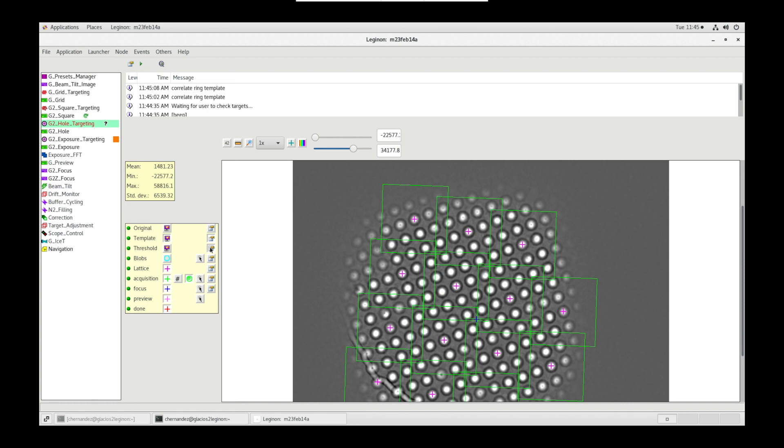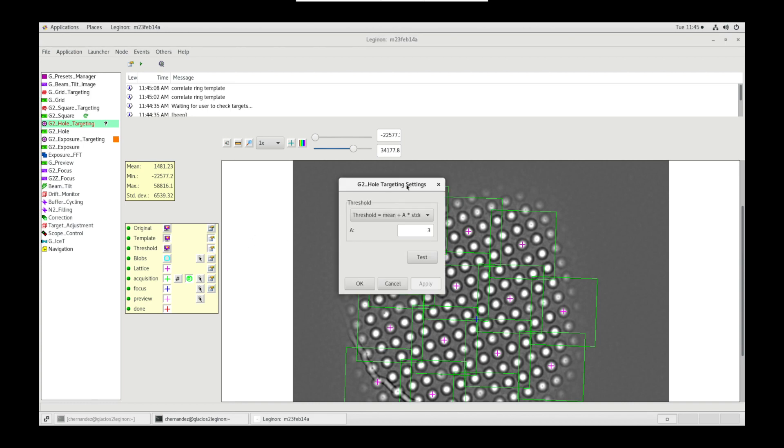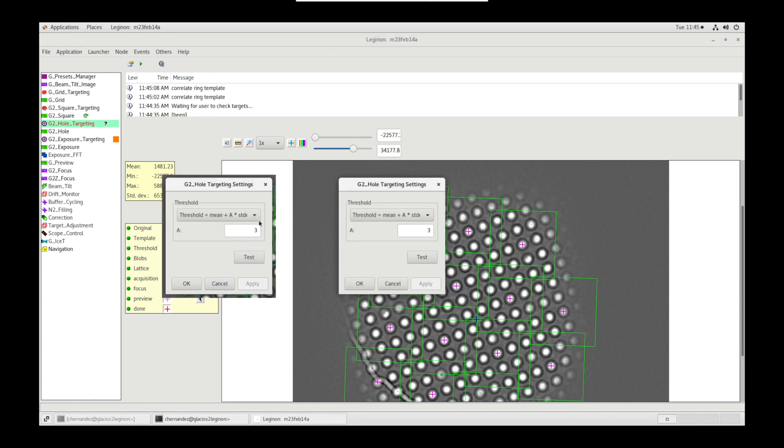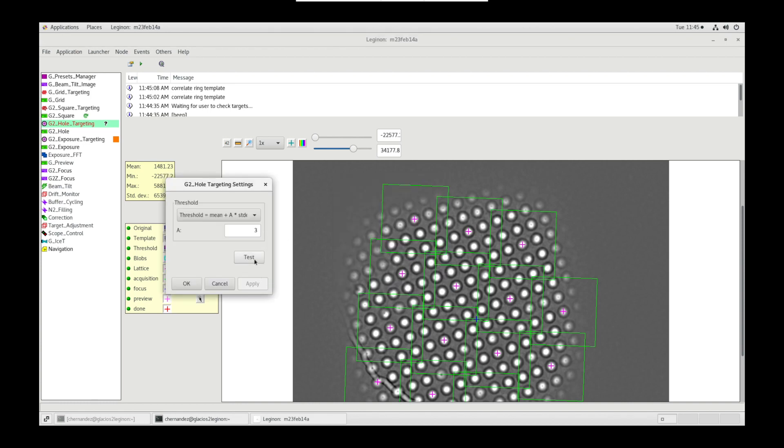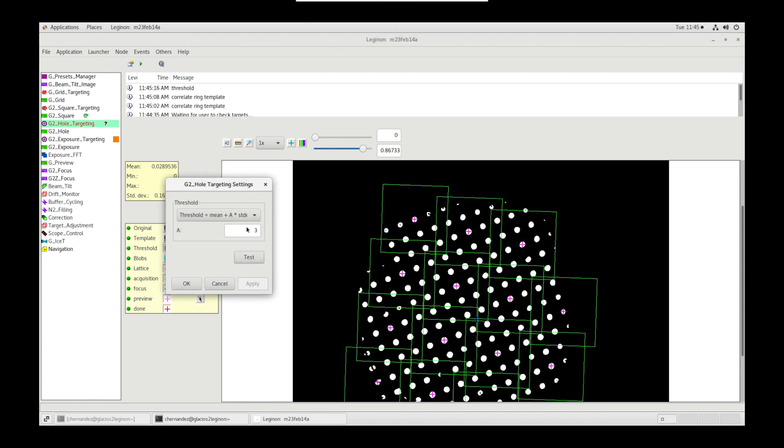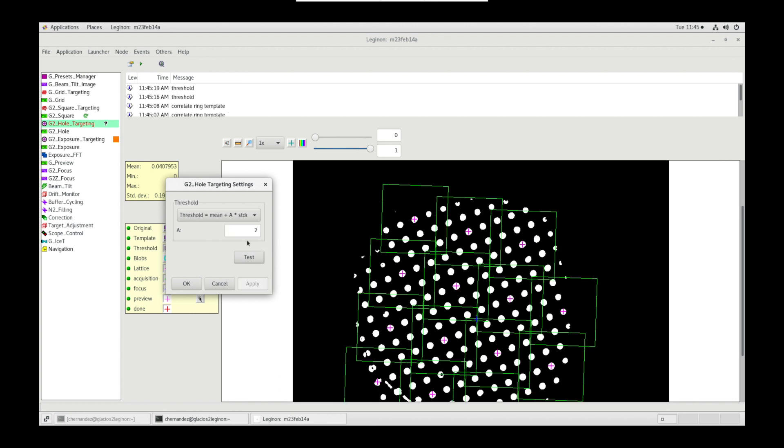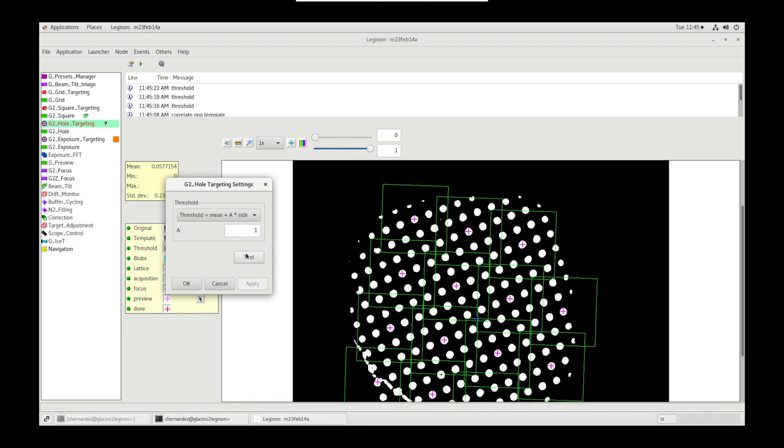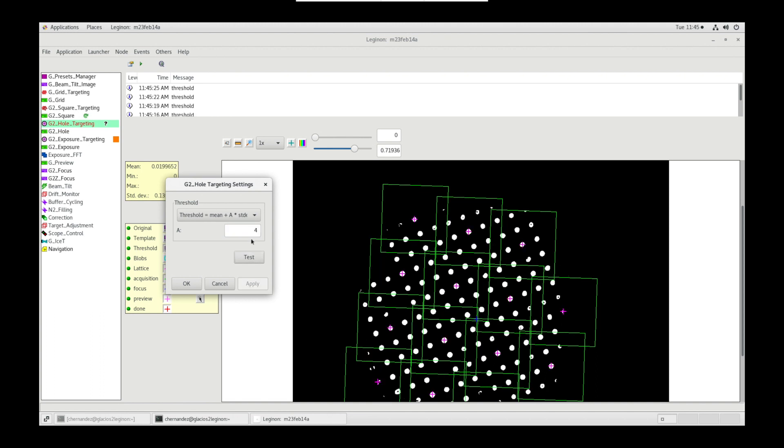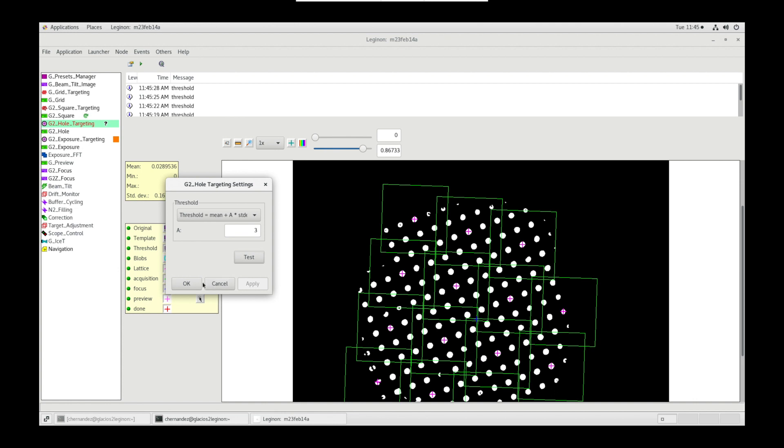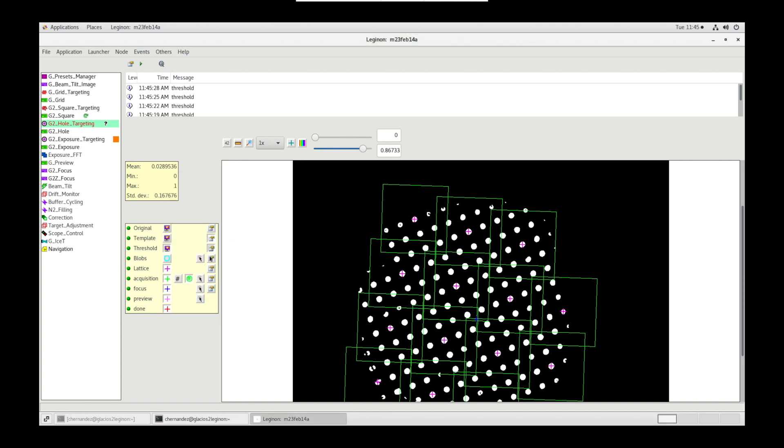Now let's go into threshold settings and let's click test. The lighter areas will become white and the darker areas will become black. Lower the number, the less threshold. Higher the number, the tighter the threshold. In this case, let's use 3. OK.